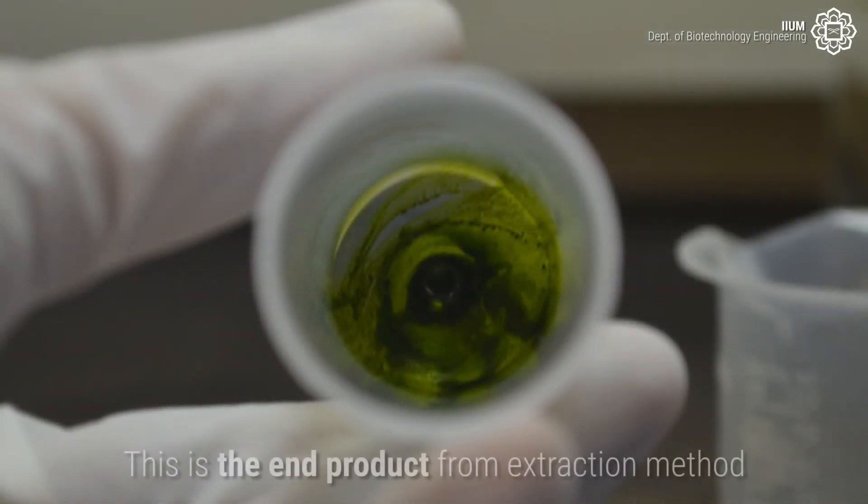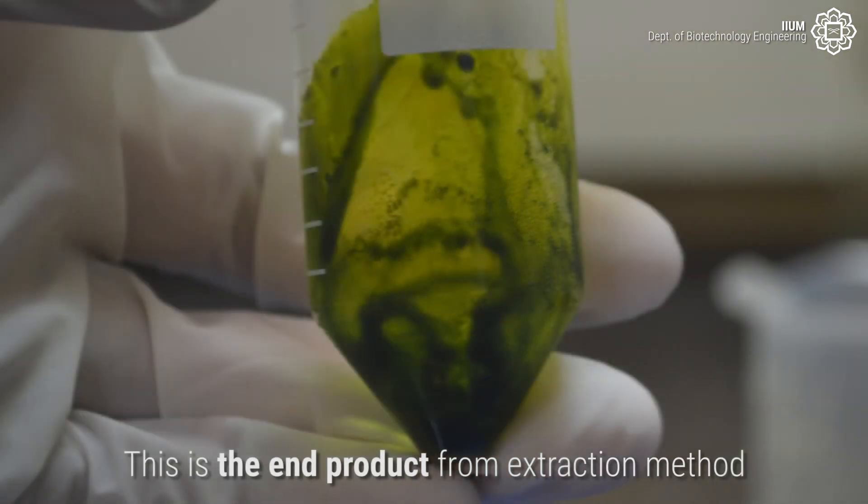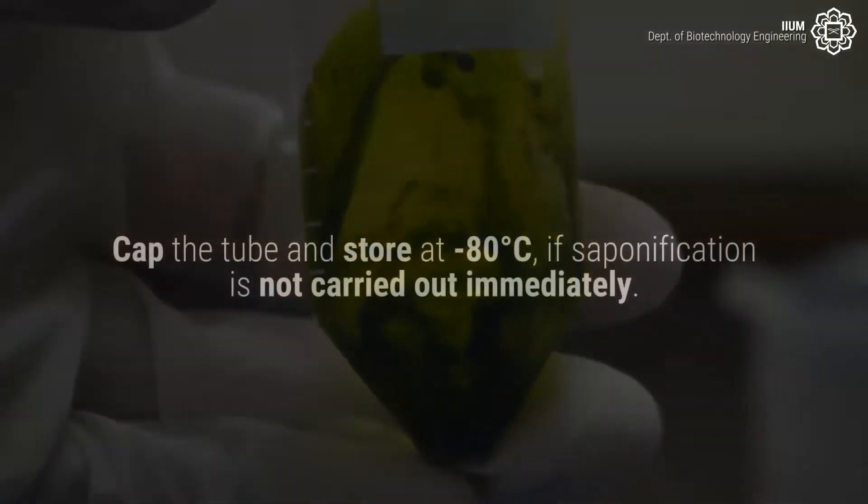Transfer the fluid to a falcon tube before continuing the drying process. This is the end product from the extraction method. Cap the tube and store at minus 80 degrees Celsius if saponification is not carried out immediately.